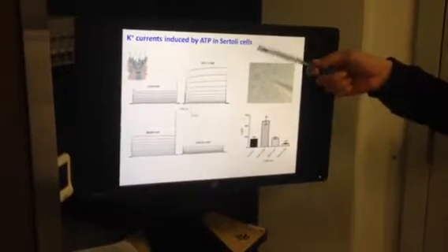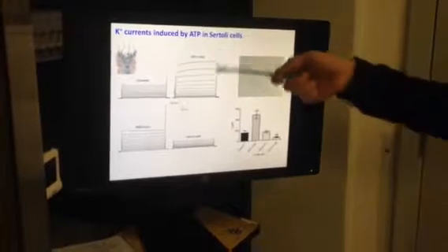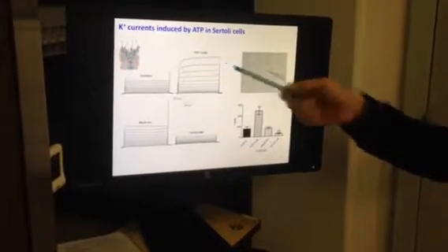So this is very nice because this professor, this student actually, a PhD student, is showing that ATP is very toxic for the cells and activates a lot of kinds of oxidative stress and things like that. So this is another project we're running in the lab.